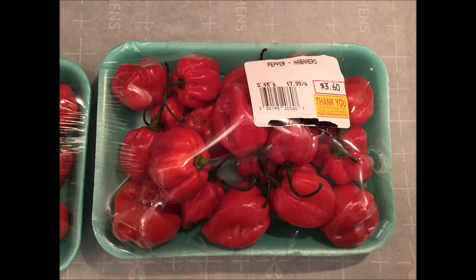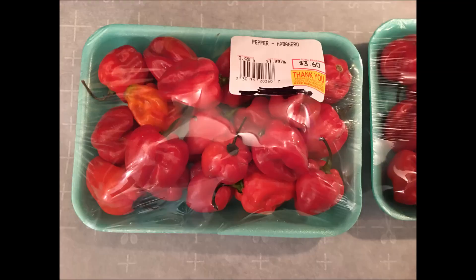Today, I will be extracting capsaicinoids from habanero peppers. You can use any peppers you want, but I used habaneros because they were the hottest I could find. At the end, I will be doing a taste test of the capsaicinoid extract.